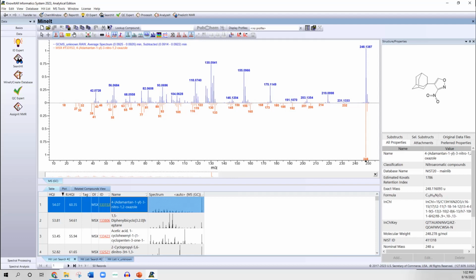Before I show you the results that you would have gotten in the adaptive mass spec search for this unknown, I want to look at the more standard identity search that one would normally employ before the adaptive search was available. You can see on the top we have the EI mass spectrum of the unknown, and in the bottom we have the reflection of it showing the best hit that it got from the identity search. And you'll notice that it's this compound up in the right corner. Well, if you look at the hit quality index, the HQI value, you can see it's much below 70. And in general, when you get down in this range, usually the results that you get are not indicative of any useful information about the unknown.